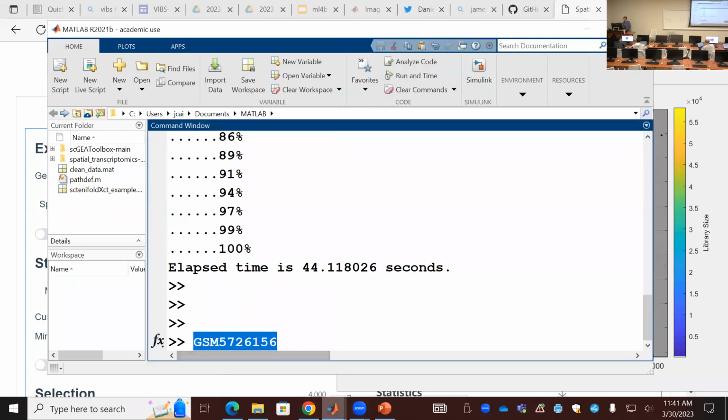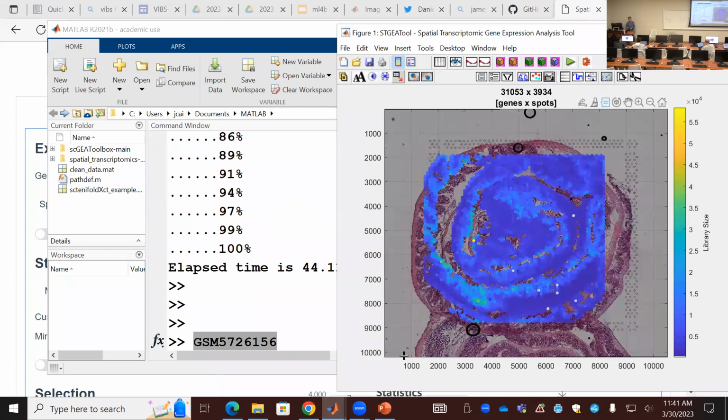This is ID here, okay? ID is here. See whether you can find a way to align this perfectly with this picture. This is just one time. Once you finish alignment, you can save the file. Next time you don't have to do it.